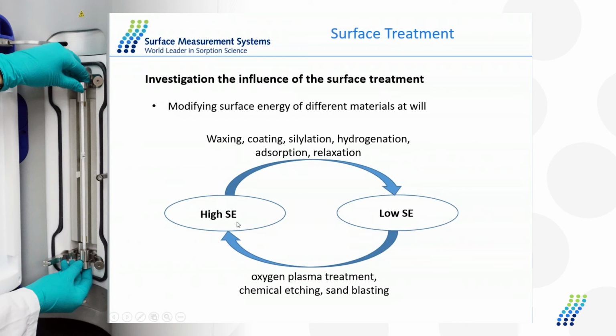On the flip side, you might have a very high surface energy material, say a carbon nanotube, other nanosilicas or nanomaterials, maybe carbon blacks, activated carbons, which may have extremely high surface energies. If you put those powders into some matrix, like a polymer, with the high surface energy, those powders will tend to agglomerate and stick and will not disperse into the matrix because they want to stick to themselves.